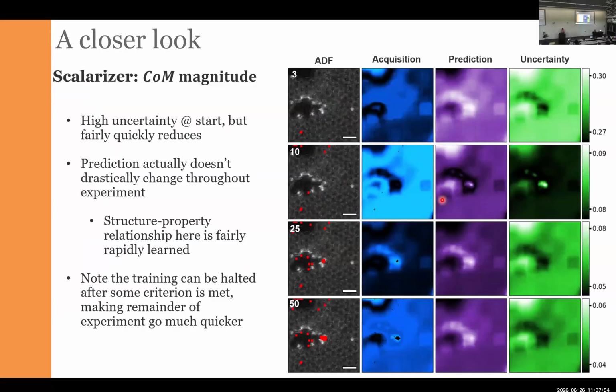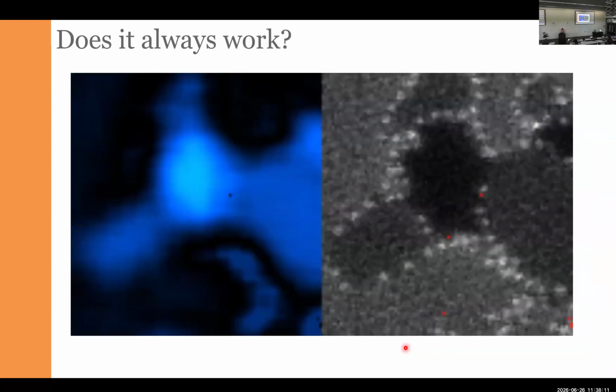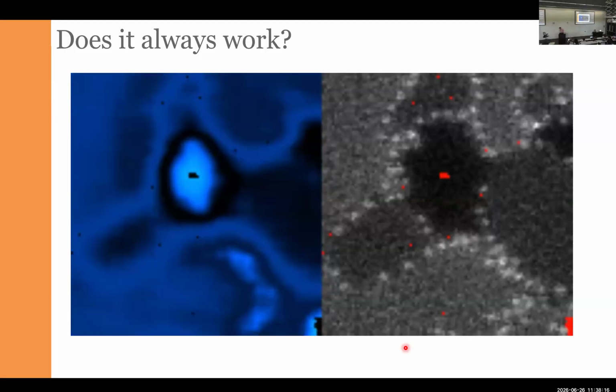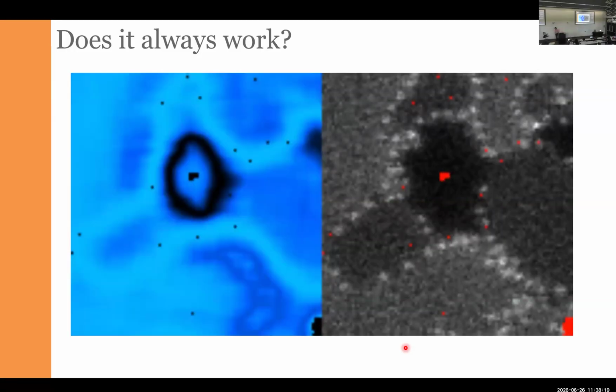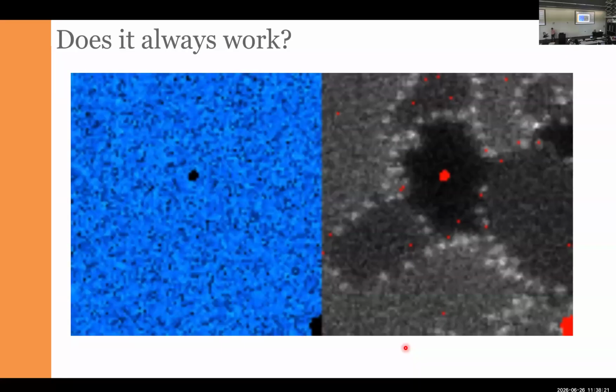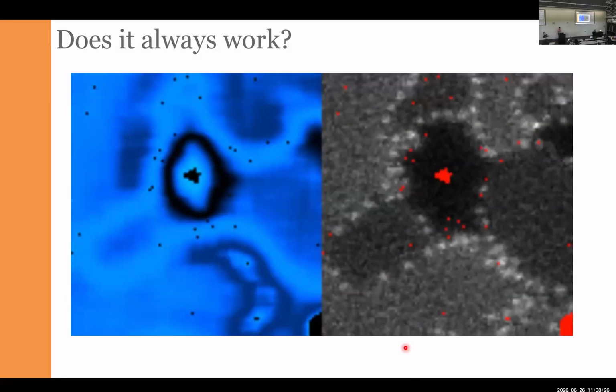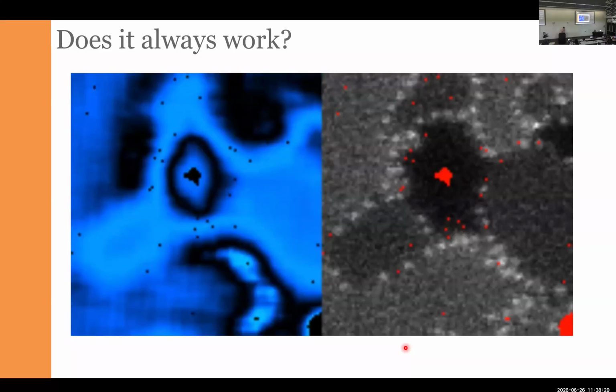So practically, it is possible to do a little bit of tracing of why it decided to do that. So for the experiment, we have the image, acquisition function, prediction, and uncertainty. So we can see how all of these functions change as a function of time. But we started to realize that for this type of experiment, a big problem becomes how do we define the reward function.